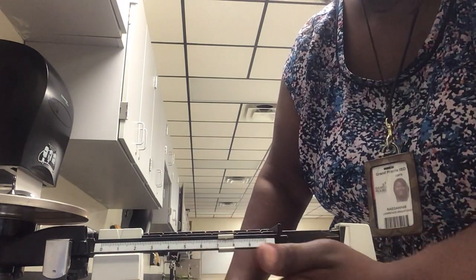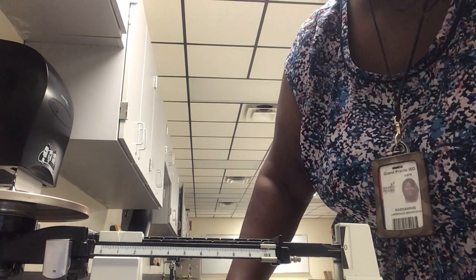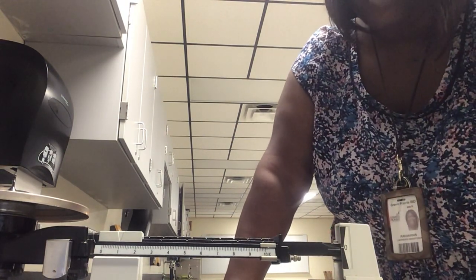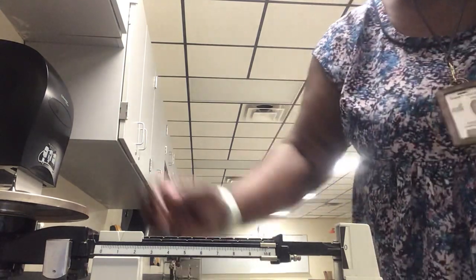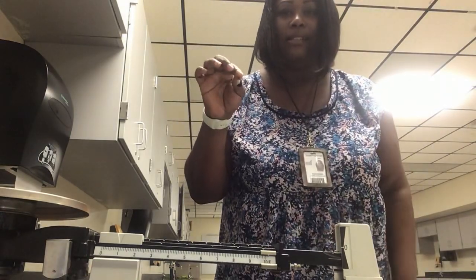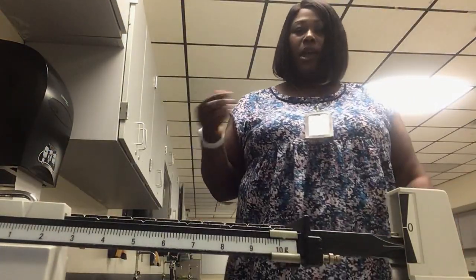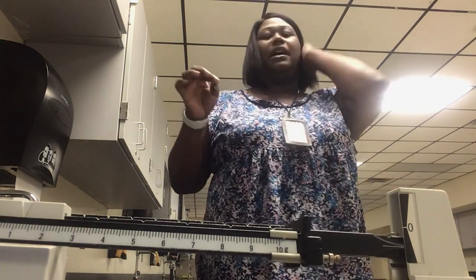Notice when I put the weight on it, it's not at zero anymore. So at 10, it starts to move. And notice when I put it on 10 grams, it is roughly at about zero, which means this particular irregular shaped item weighs 10 grams.